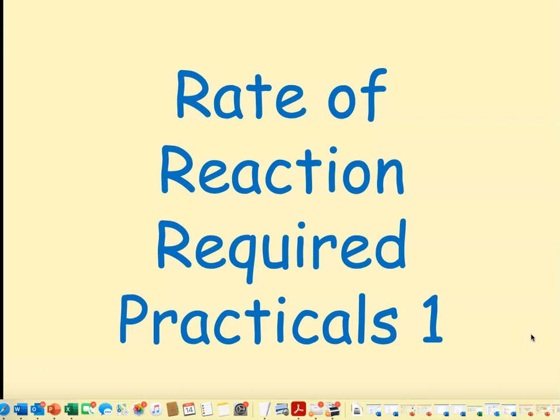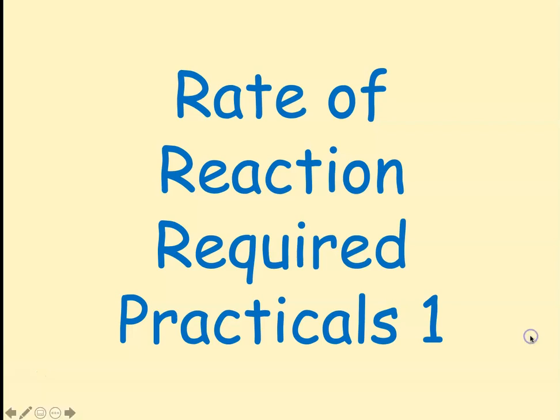Hello Year 11. We're going to follow on from the last screencast where we learnt about experimental techniques to measure a rate of reaction, and we're going to go on to the practicals that we will need to know for our required practicals, and this is going to be the first one.